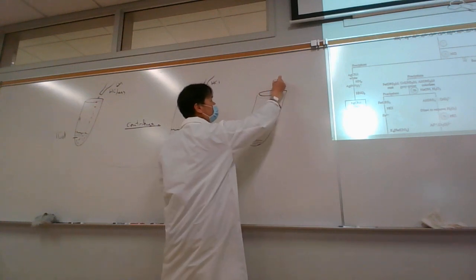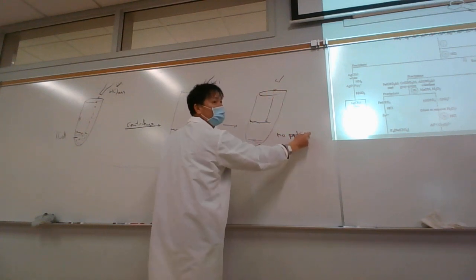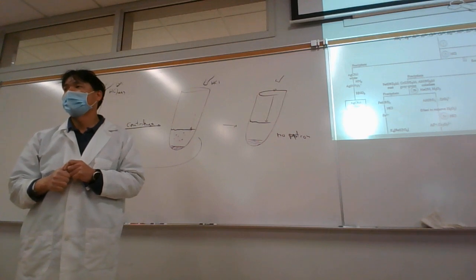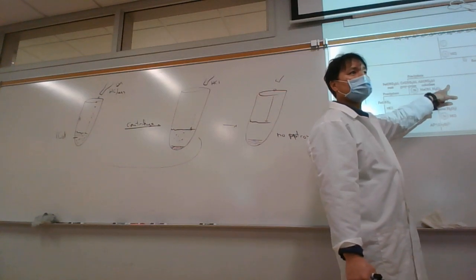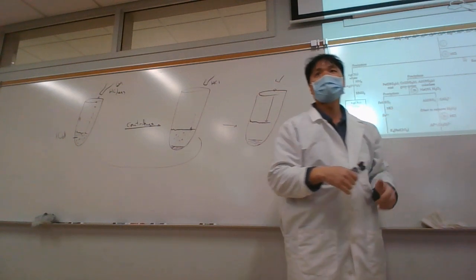And so with 1 drop of HCl, we get no precipitation. Then you know you've added just the right amount. Not too much, not too little. This goes for every single precipitation that we do. For every single precipitation that we do, I don't write the amounts. I adjust the amount until it's perfect. Does that make sense? You want it perfect.